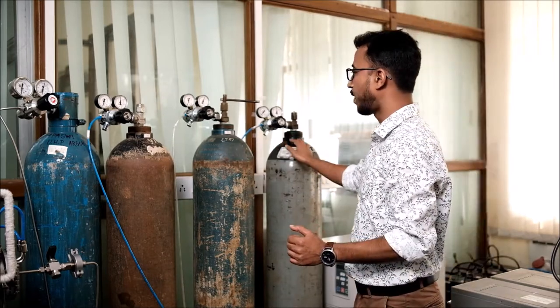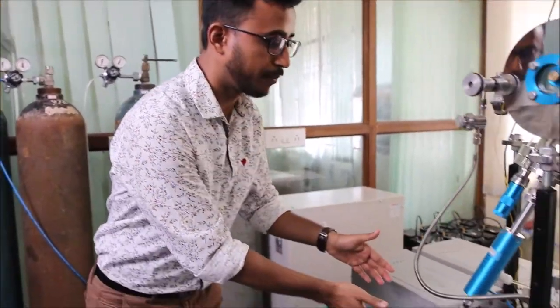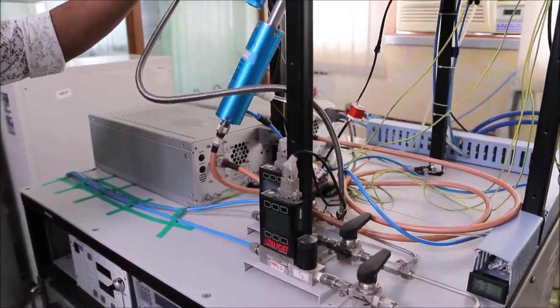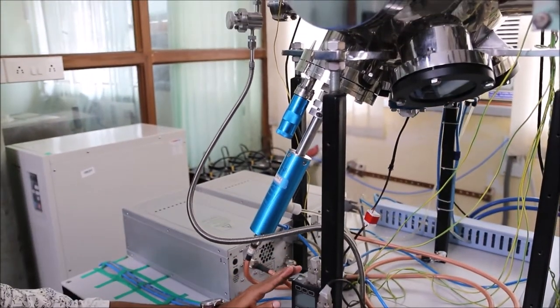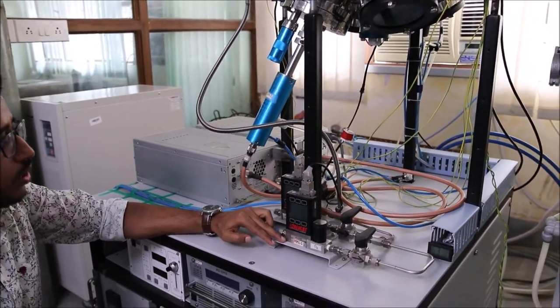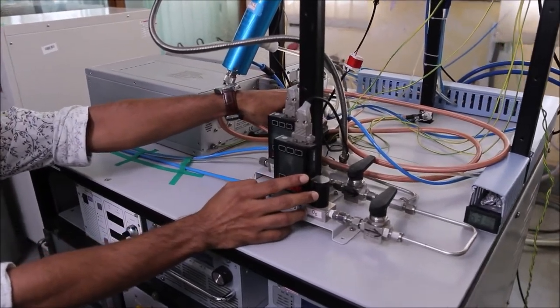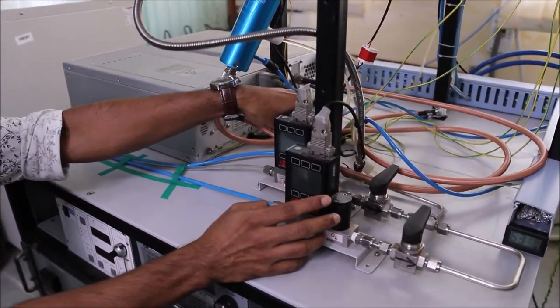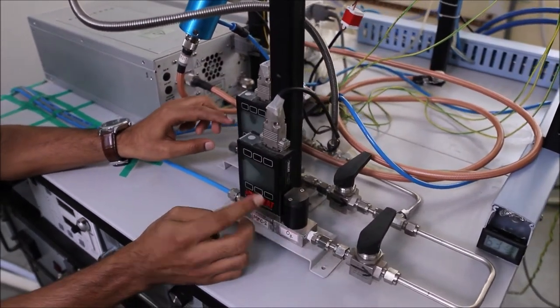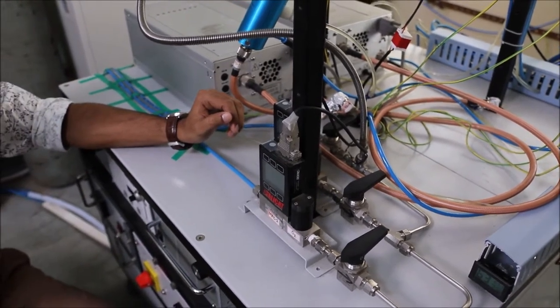These gases are passed through a regulator, and then come through the pipe and through the mass flow controller into the chamber. We have two mass flow controllers — one for argon and another for oxygen. We don't have a mass flow controller for nitrogen because for venting purposes we don't need that level of control. Through these buttons we control the outflow of the gases to maintain a particular ratio for our deposition system.